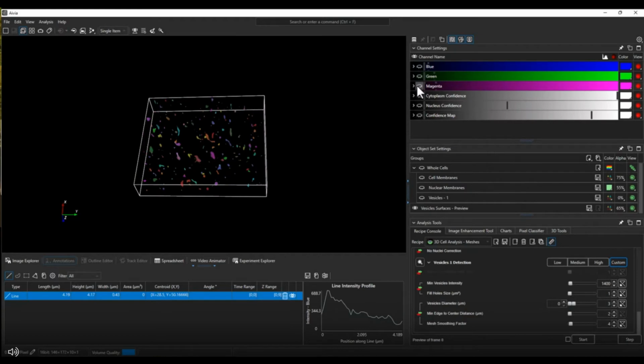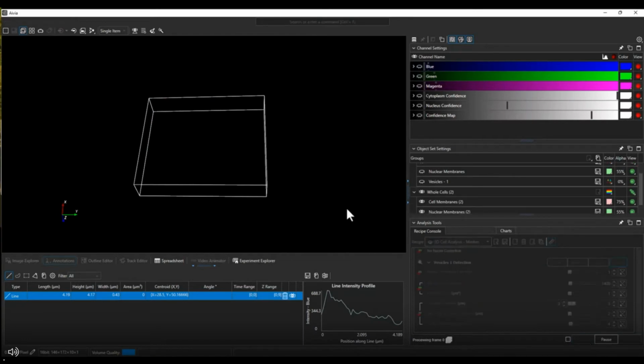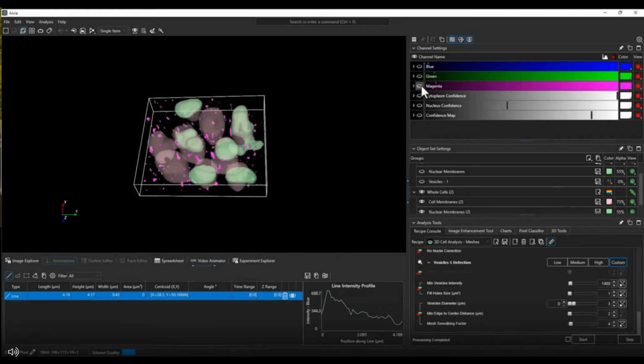And it looks pretty good to me in terms of the placement of the vesicles. You do have the option to actually apply partition for the vesicles based on the size. And in this example, I've skipped background subtraction and image smoothing. Now, once I'm happy with the parameter, I run for the entire stack, and here's my output.